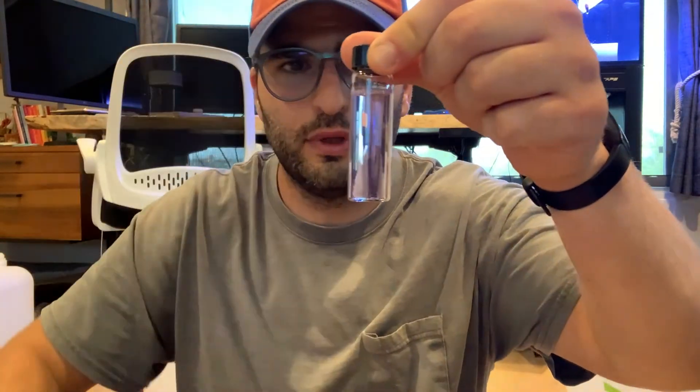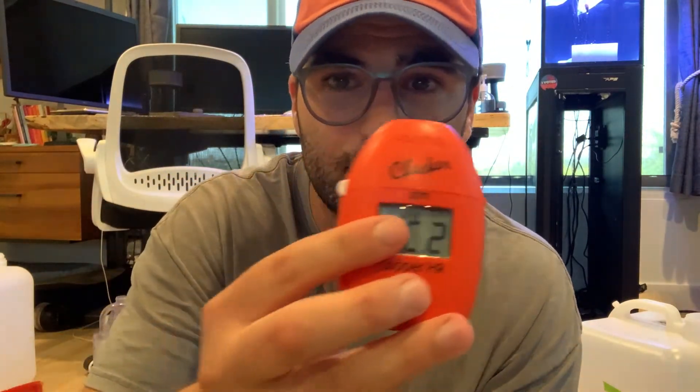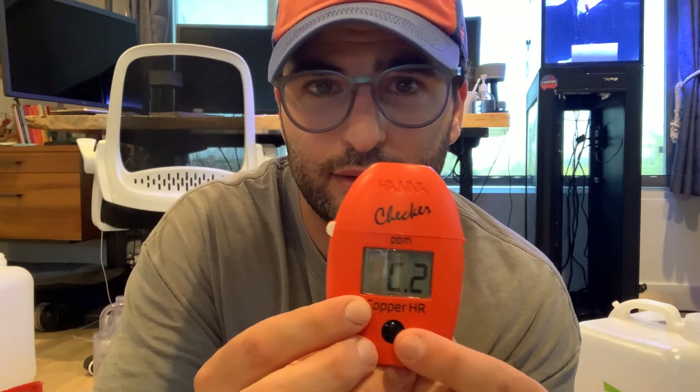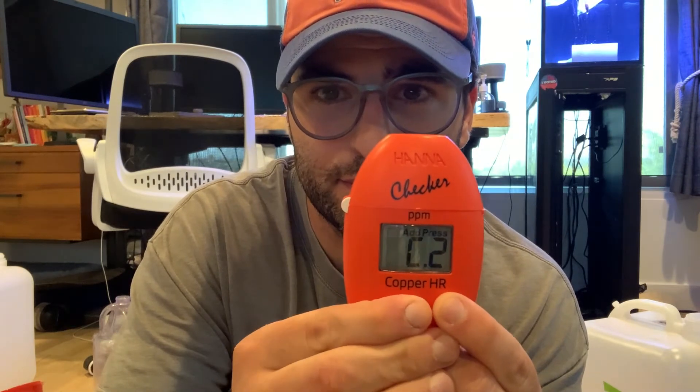Make sure you have no floating sediment in there and no bubbles at the top. Now put it back in. Here's the step I kept screwing up: it says C2, and you need to press and hold this button for three seconds. Then it's going to start a 45-second countdown. Now we just wait 45 seconds.